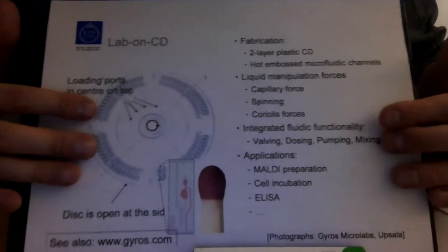Right. The next type of technology platform, we're going to talk about actually 4 different types of technology platforms here for pure lab on chip. One is the PDMS base that I just showed. The second one is the lab on a CD. The third one is electrowetting on dielectric, and the fourth is droplet microfluidics. But first we go to lab on a CD. And here I'm going to talk mainly with overhead slides because it's the best way of showing things.